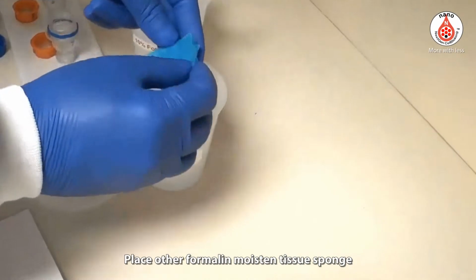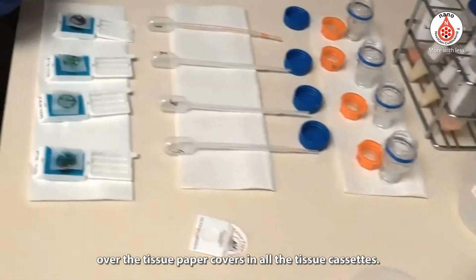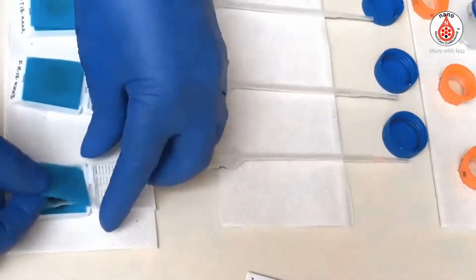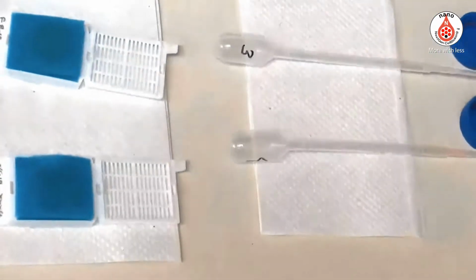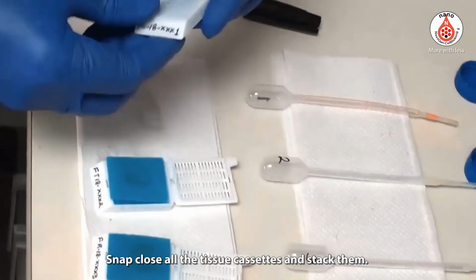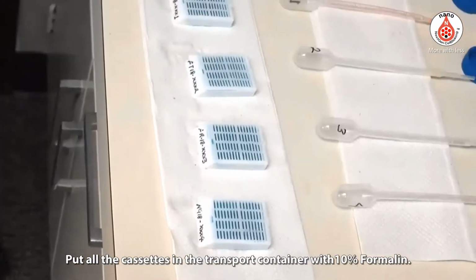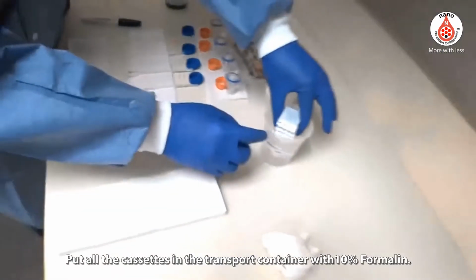Place another formalin-moistened tissue sponge over the tissue paper covers in all the tissue cassettes. Snap close all the tissue cassettes and stack them. Put all the cassettes in the transport container with 10% formalin.